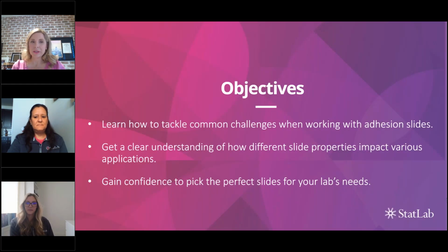First thing we want to talk about, we want to tackle common challenges when working with adhesion slides, get a clear understanding of how different slide properties can impact various applications. And then also at the end of the day, we want to make sure you guys feel confident making a change or continuing to stay with the perfect slide for your lab's needs.